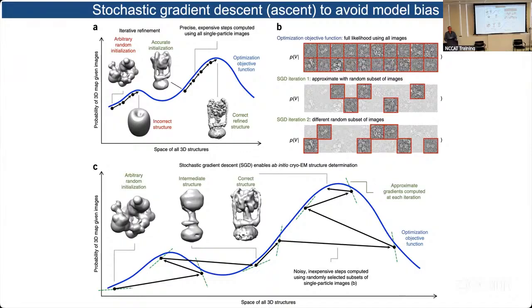Yeah. So for the projection direction computation, how does one consider how many projection directions you can try and fit things to? I guess it would probably be related to the Nyquist if you try and get all of them. Right, yeah, it's related to the Nyquist.